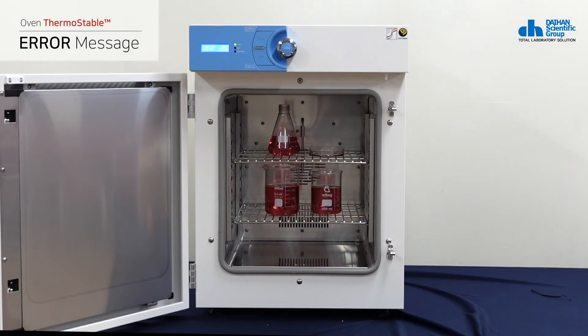For your safety, if the drying oven door is open for more than 10 seconds, the display will show 'Err 3' and a beep will sound.